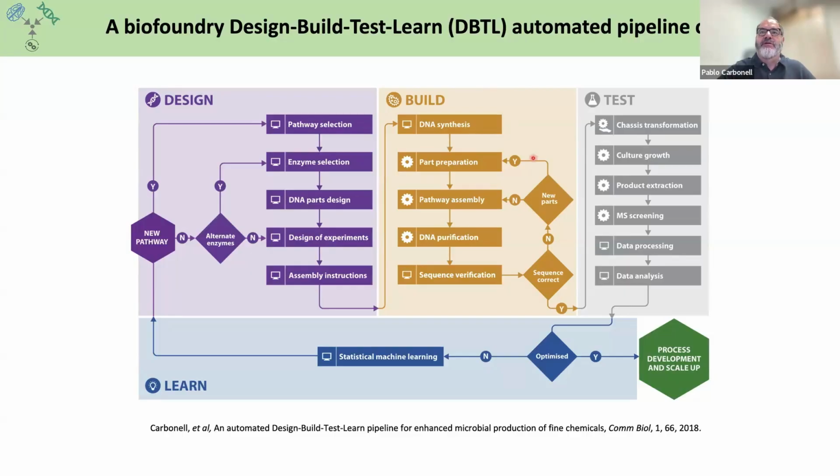or implementing those different strains that are then quantified at the test stage that generates omics data, that then is fed back into the learn stage that will use some type of predictive modeling for generating new design rules. So that's the basic idea of the biomanufacturing cycle, very similar to other manufacturing industries. And this is what we wanted to highlight here.